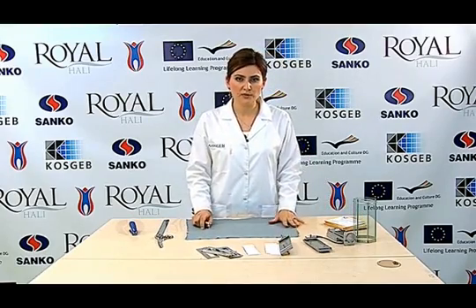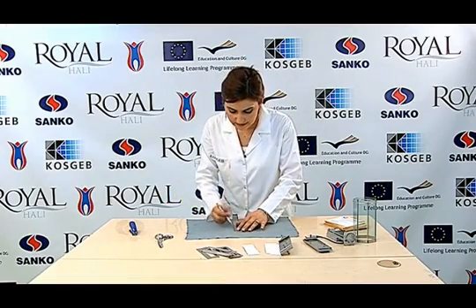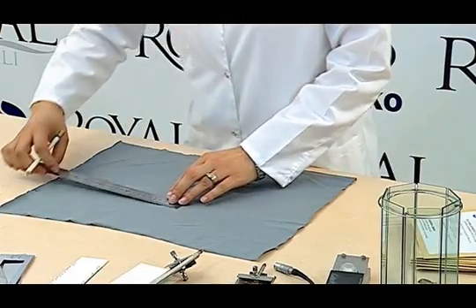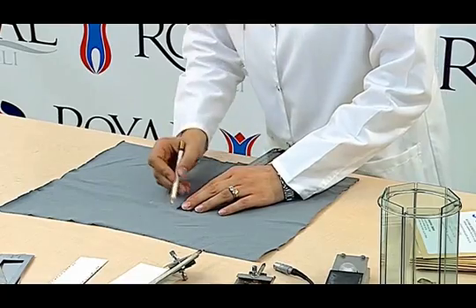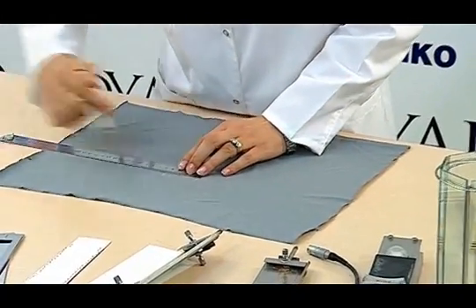The sample is laid out on a smooth surface. A sample of 1 cm by 4.5 cm is cut. The sample is properly marked.